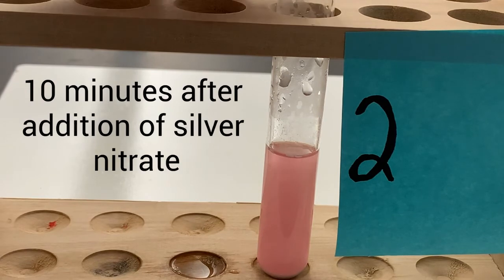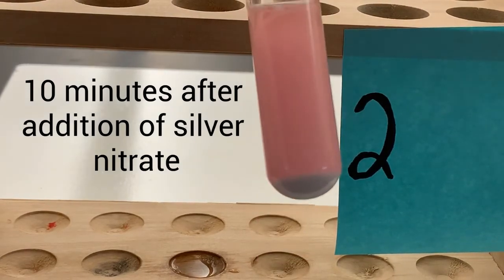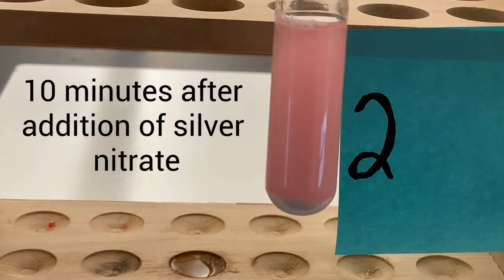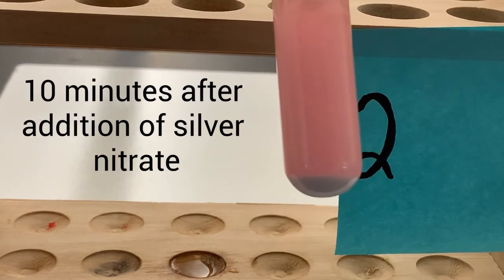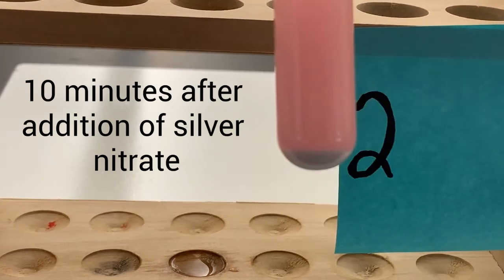This is test tube 2, about 10 minutes later. So you can see that a precipitate has settled out in the bottom here.